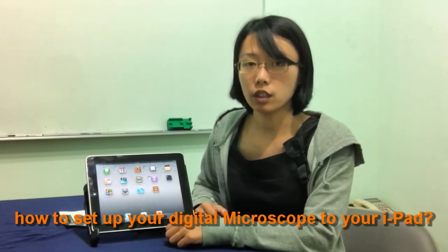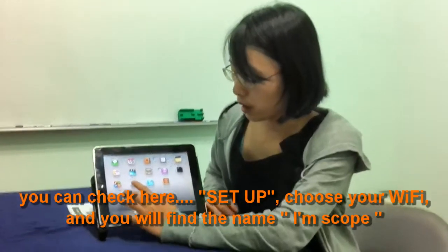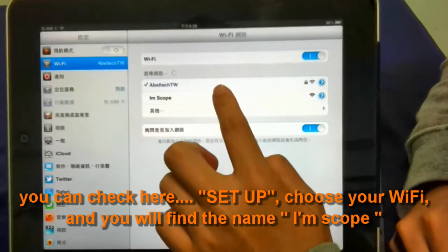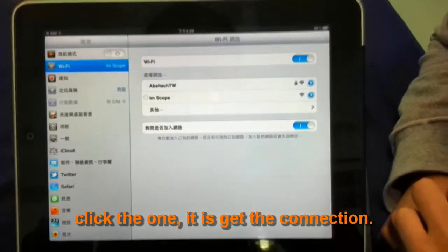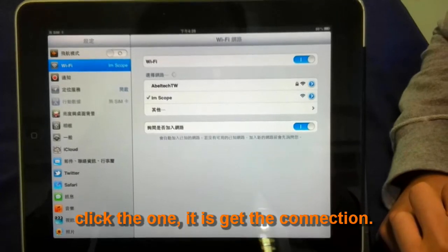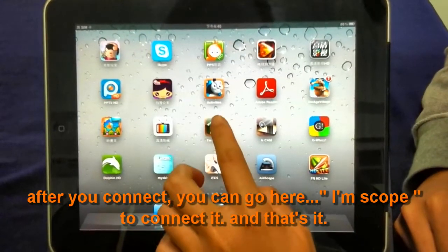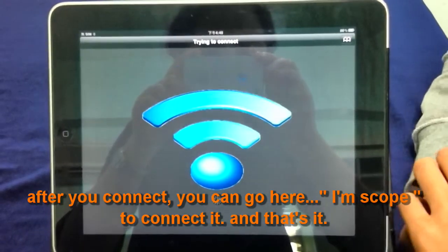How do you set up your digital microscope with your iPad? Go to Settings, choose Wi-Fi, and you will find the network named iamscope. Click on it — it's connecting. After you connect, open the iamscope app to launch it. And that's it.